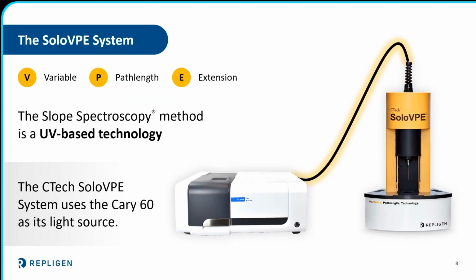The SoloVPE uses the Cary 60 as its light source. It is still a spectrophotometer that can be used for traditional UV methods. However, in our case, we are utilizing the light source via a fiber optic cable to bring the light into the SoloVPE itself.